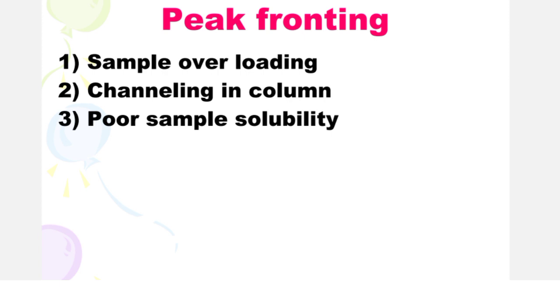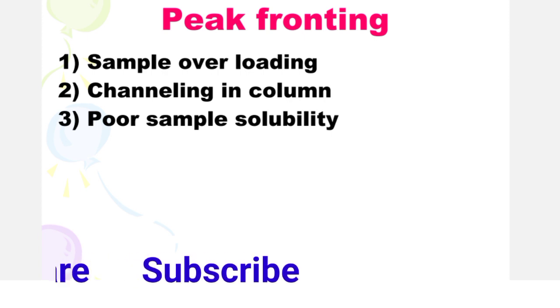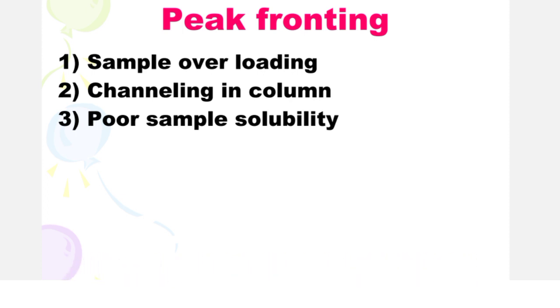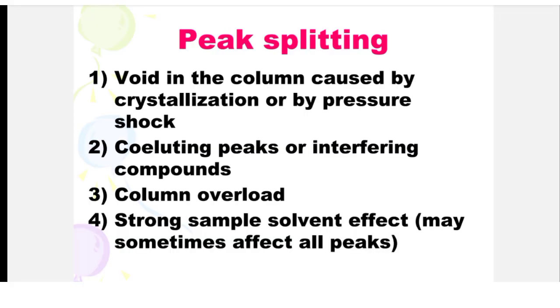Peak tailing also occurs when some chelating compounds show a singular tendency to adsorb to the stationary phase, and when there is sample overloading. Next is peak fronting; peak fronting is due to sample overloading, channeling in the column, and poor sample solubility.